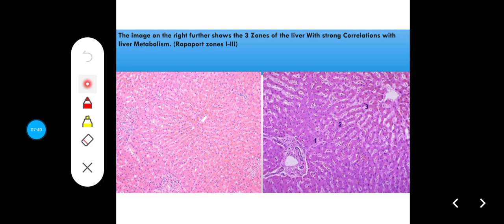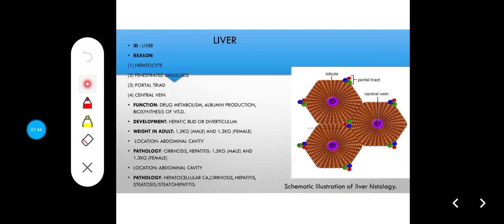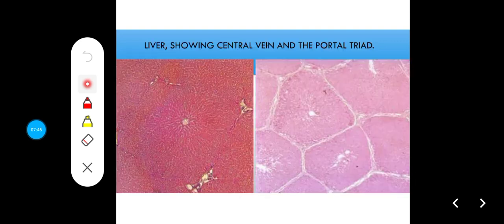central veins. So let's go back to the previous image and illustrate this. So something like this. Let's see these two central veins, this one and this one. So it looks like this. See how the thing runs.